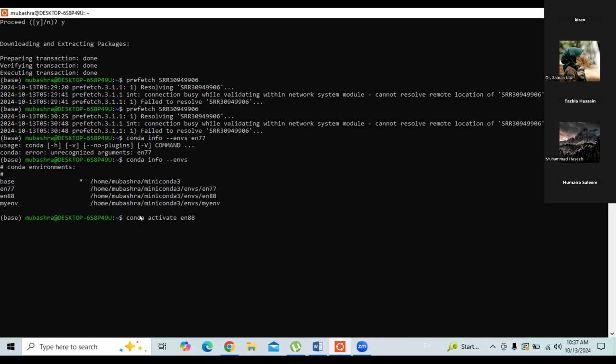Now press enter. Okay. Now try to install the SRA Toolkit. I have just pasted the command in the chat.